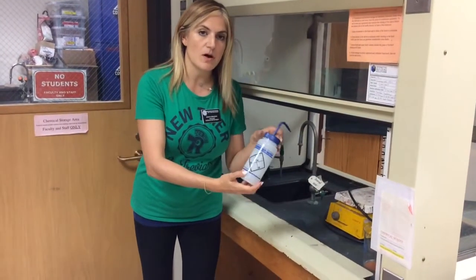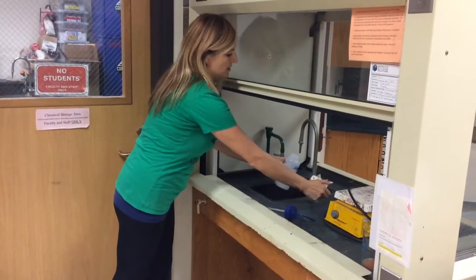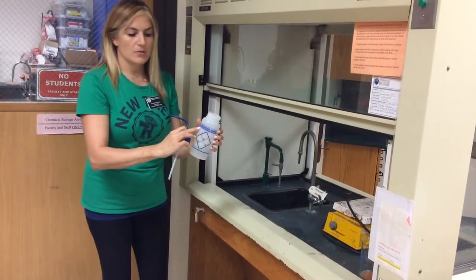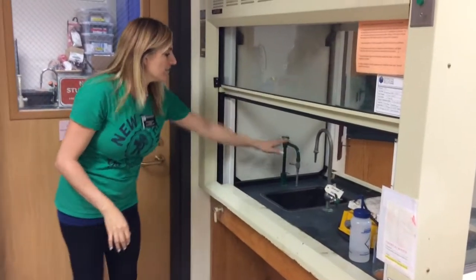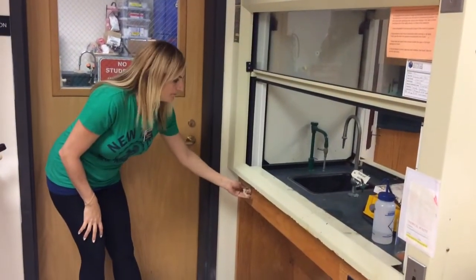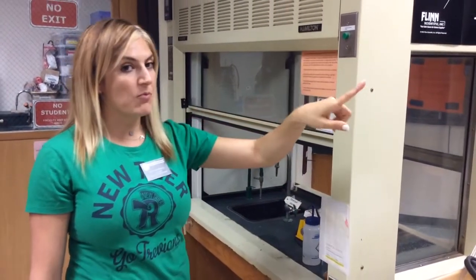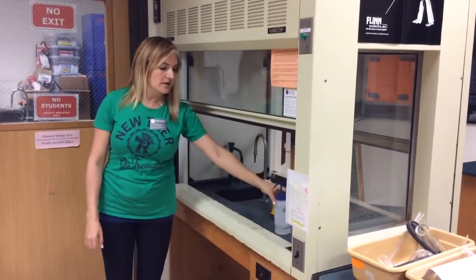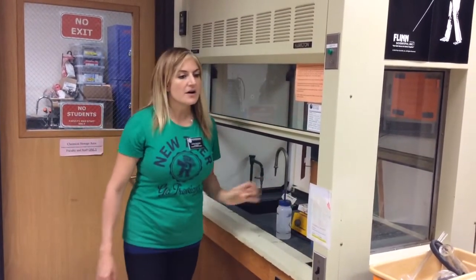This is a deionized water bottle that we'll be using in lab. I will fill up my bottle with the deionized water, not the tap water, right? Not the tap water. If at any point I need to use the tap water, the handle for the tap water is down here. Please note that all of your stations have faucets, and those are tap water faucets. The only place to get deionized water is under the hood to fill my bottle that I then can take to my station. Okay?